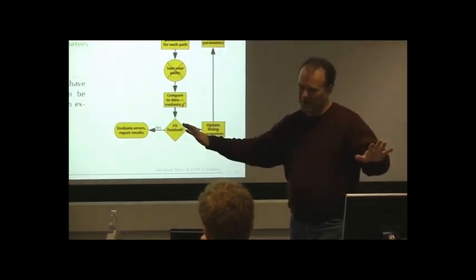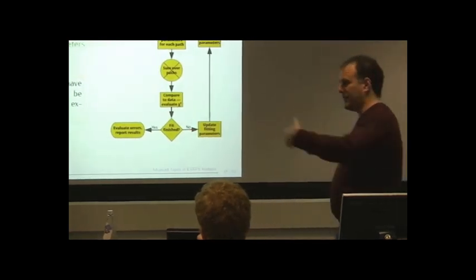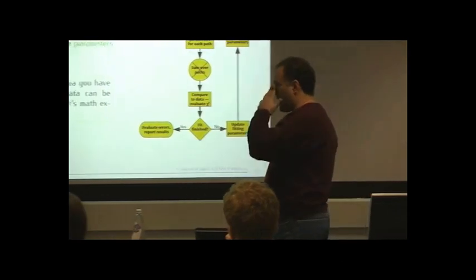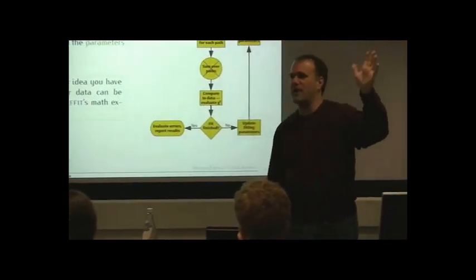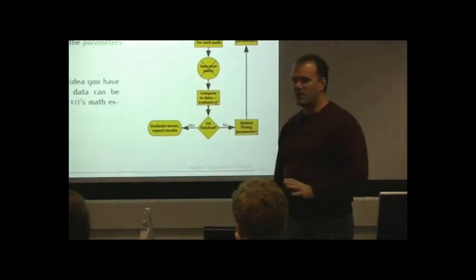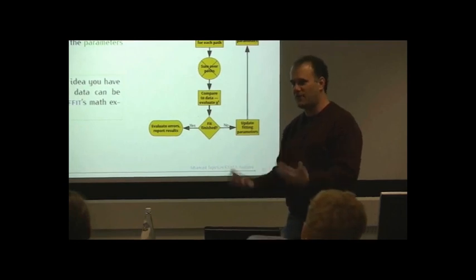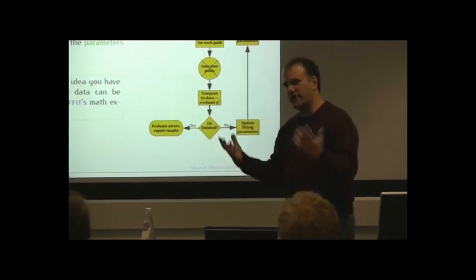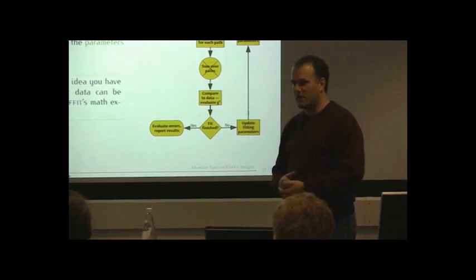So you certainly can, and if the situation is, as you say, that every single sample for which you have measured the edge, you keep getting the same value of s0 squared, and you feel confident in fixing it, and you feel confident that you're not unduly biasing other parameters, then by all means do so. But you have to be mindful that you've made a choice that has consequences.